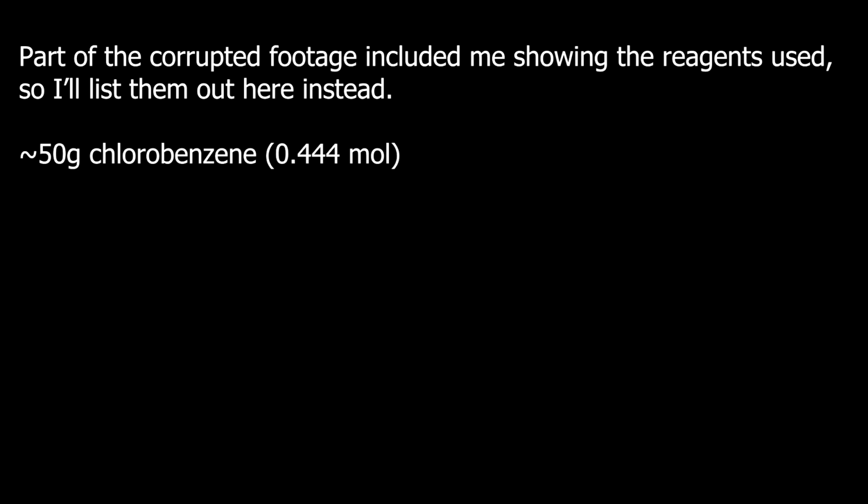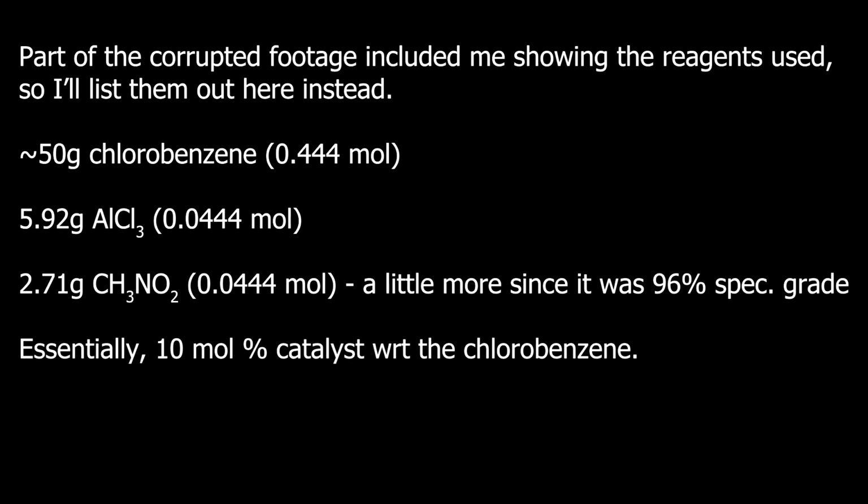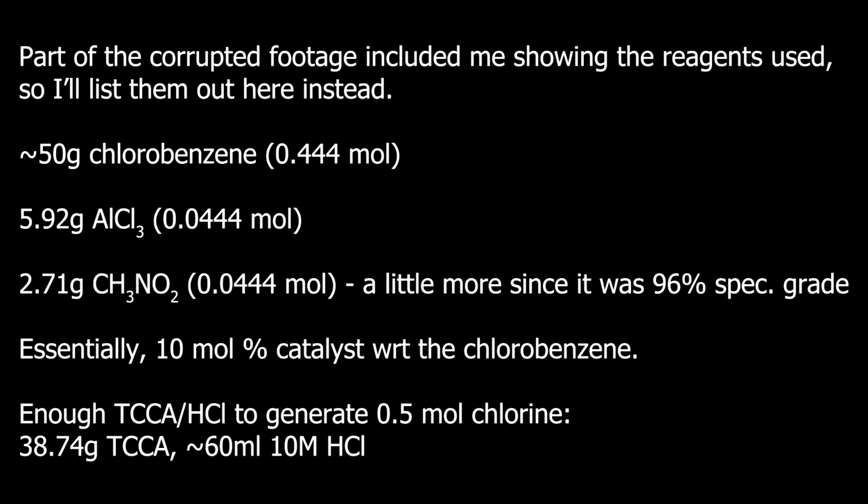I used all of the chlorobenzene, which was 50 grams, and I used 5.92 grams of aluminum chloride, and then 2.71 grams of nitromethane. I used a little more than that because it was a 96% spectrophotometric grade, and it's essentially 10% by mole catalyst with respect to the chlorobenzene. And then enough TCCA hydrochloric acid to generate half a mole of chlorine in those quantities right there. I always use an excess of acid.